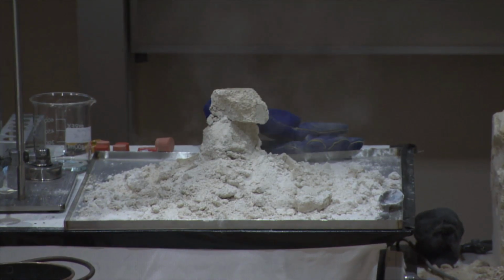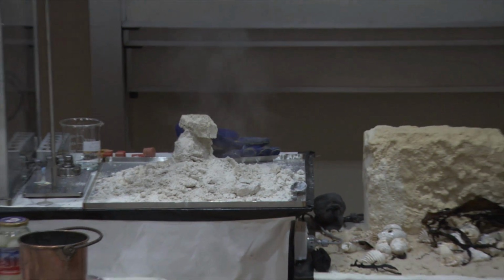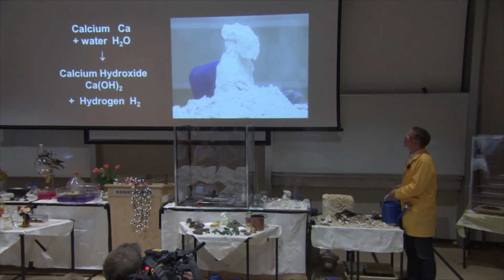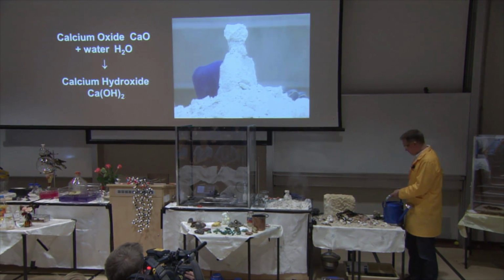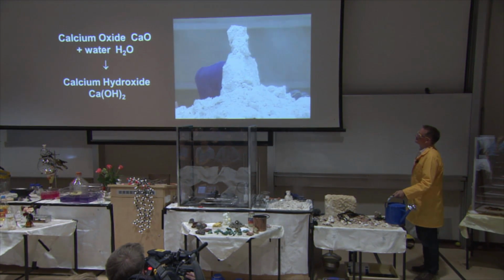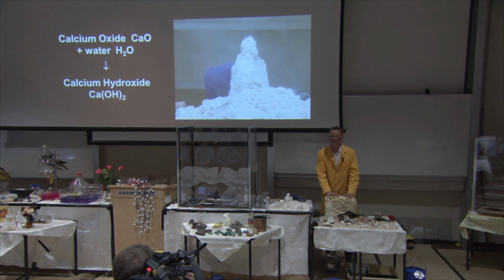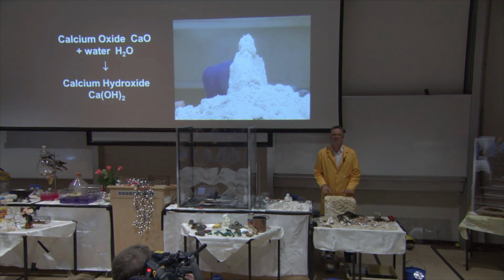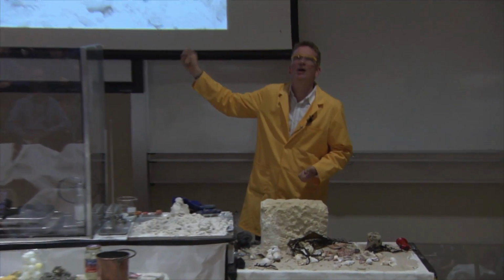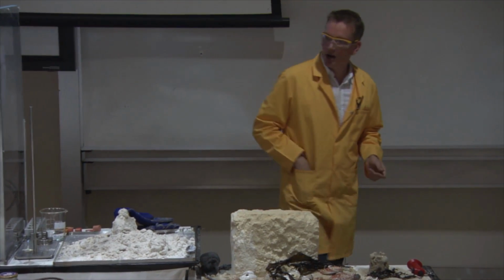And the chemical equation for the reaction taking place here is, well, the calcium oxide that we've made by driving the carbon dioxide out of the calcium carbonate. The calcium oxide reacts with the water and we're forming calcium hydroxide. So, very, very different from our rock here. Calcium oxide, which is what we made, reacts with water and forms calcium hydroxide. That is our lime water. When we dissolve it in water, we get our solution of calcium hydroxide, which is the lime water.